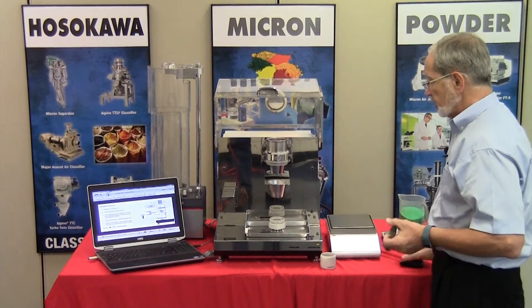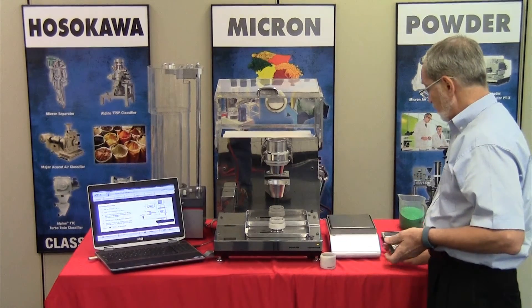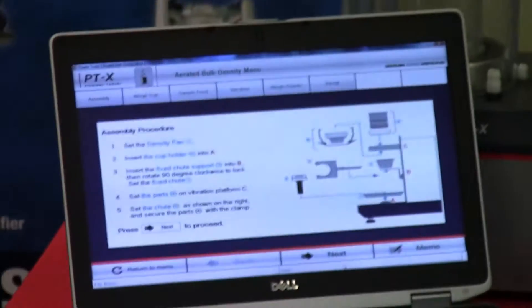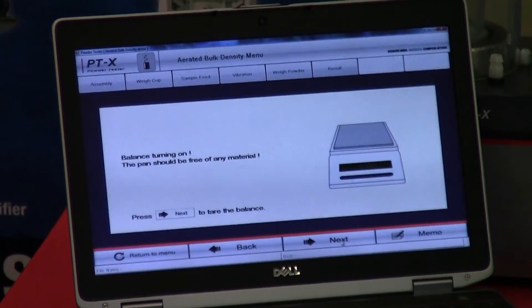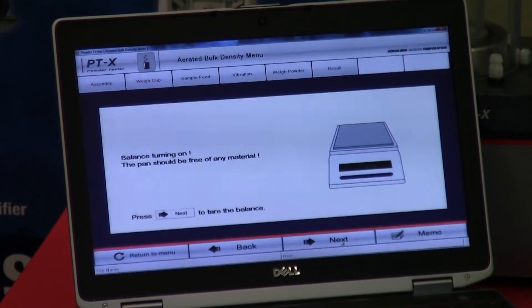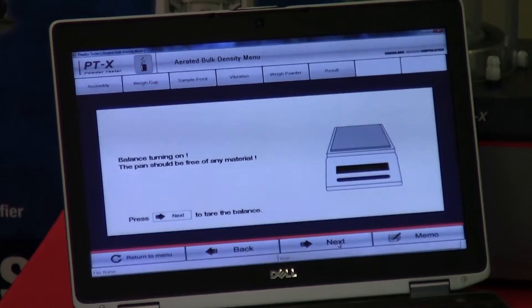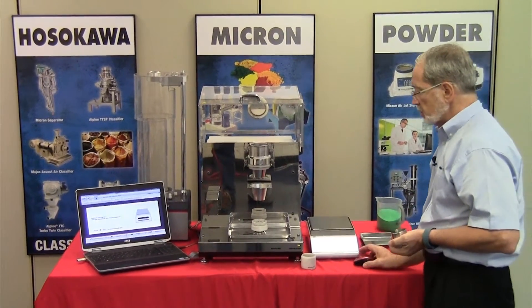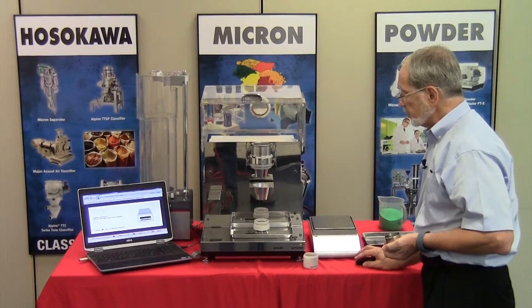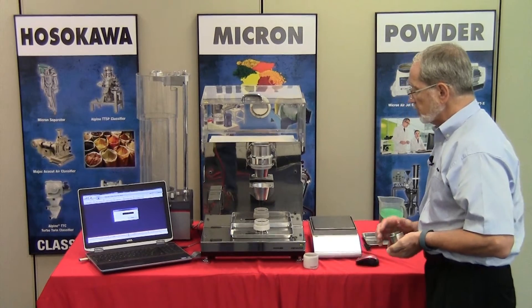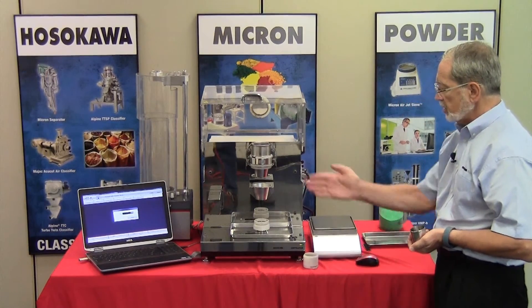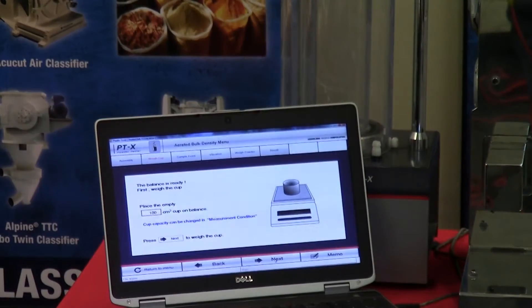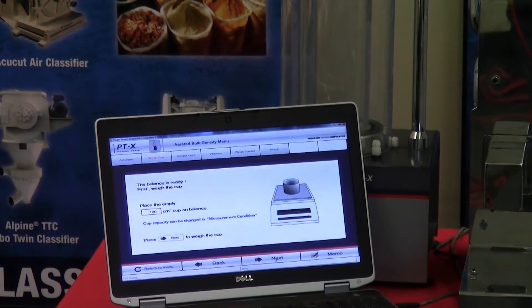Now that everything is set in place, we advance the software and press the next button. The software will communicate directly with the balance. The balance will now need to be tared, and as you can see, once the balance is tared, the display turns blue.